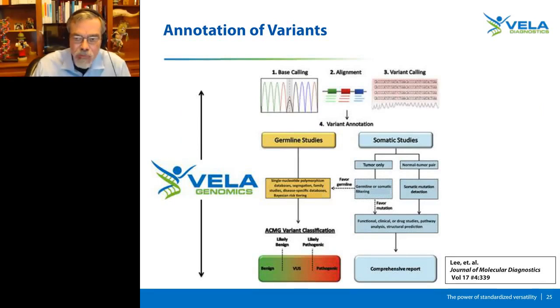Now the second step, once you have a list of variant calls, is to classify, prioritize, and annotate them. In cancer, many of the labs are sequencing both somatic cancer tissue as well as an individual's germline or non-cancer genome. This will give you a better result as to the true somatic variants, as you will be able to subtract out your inherited or germline variants. The tumor-matched normal is always the best control to determine which variants are germline and which are somatically derived.